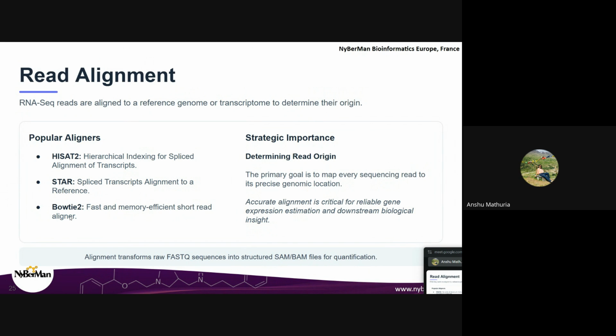So if we do an RNA-seq analysis, we can do the alignment using Bowtie. But when we have to understand splicing events, that is, where it is cutting and where it is joining, we generally use HiSat2 and STAR, because both are aware of these splice events, whereas Bowtie is generally a normal aligner that aligns your RNA to your reference genome. HiSat2 and STAR take the splicing events into consideration and align accordingly. That is why they are both considered better tools.